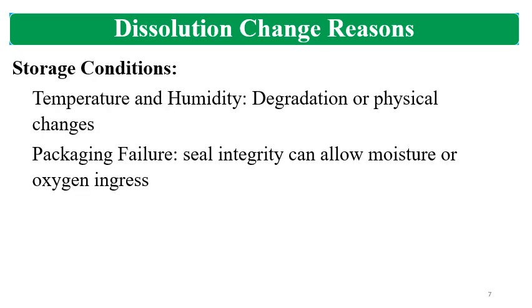Then there are the storage conditions. There may be degradation or physical changes due to improper storage, temperature and humidity exposure. Sometimes if the packaging system fails, at that time dissolution changes may happen. Seal integrity, if it is failing, can allow moisture or oxygen ingress, which leads to changes in dissolution.